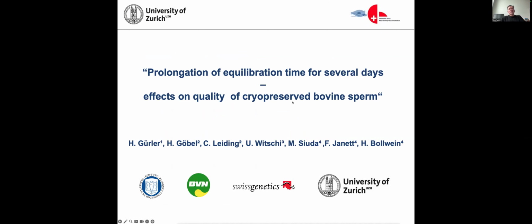Another study I would like to show you was, for me, one of my most important studies, because at this time we examined the effect of prolonging the equilibration time for several days on the quality of cryopreserved bovine sperm.